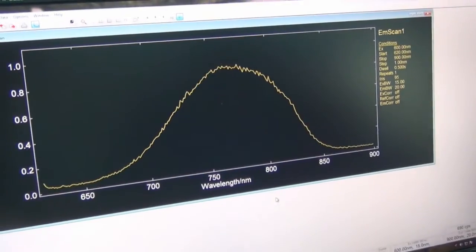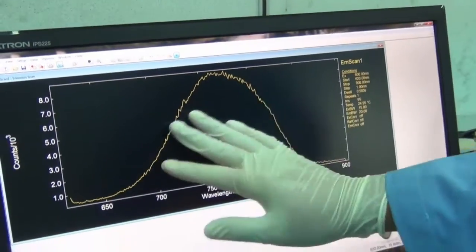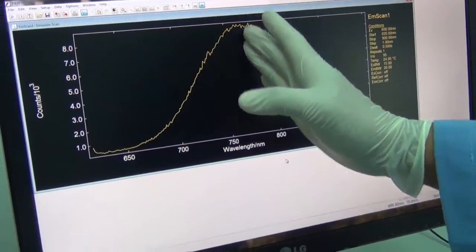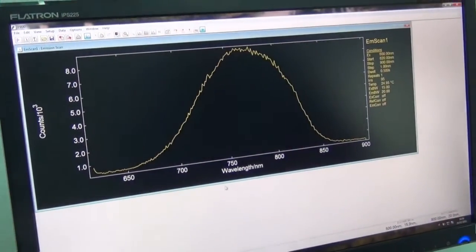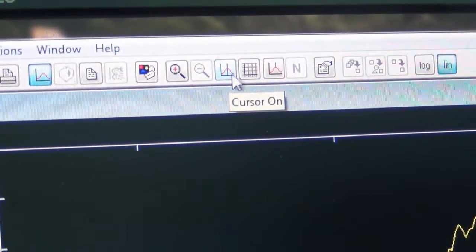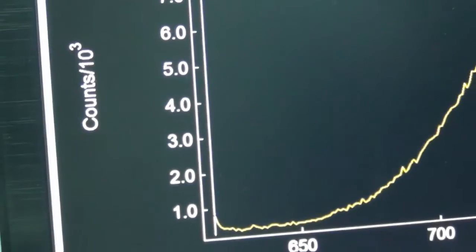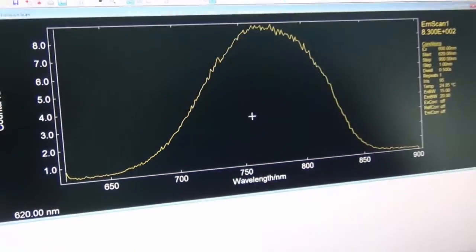Done. Now, you could determine the corresponding wavelength of the peak. So this could be the peak. You just simply click this button, the cursor button. Got it? Click the cursor button, and one vertical line will be placed over here. Just simply click this button.